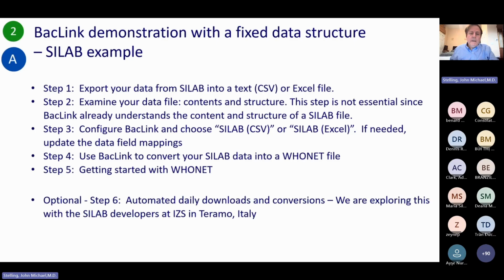The developers of SILAB are at an animal health institute in Italy, in Teramo, IZS, Zooprophylactic Institute of Investigations in Teramo. And we would like to do automation, we'd like to do it for you. So if they can set it up, then you should be able to get automatic WHONET files every day, every week. And this is currently happening now live in Kenya. So we have a pilot project. Once the Kenya one is optimized, then we will go to some of the other countries in Africa to also get them set up for some daily reports, some weekly, and some monthly reports.